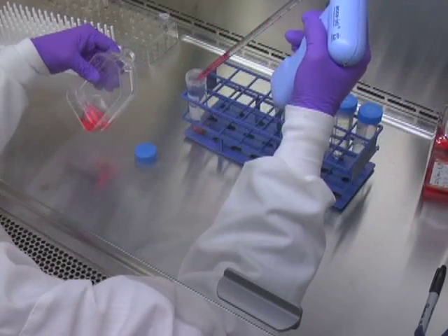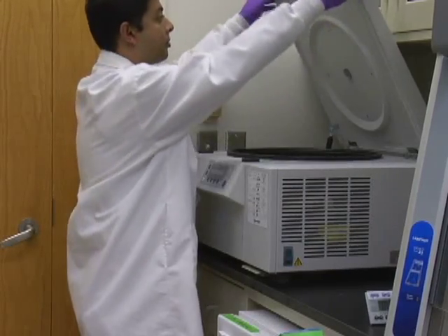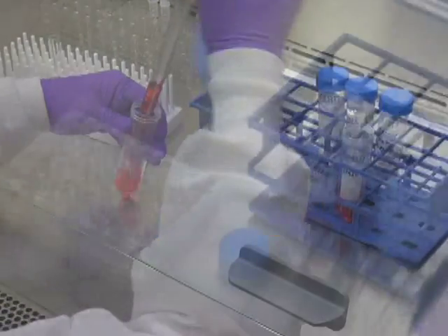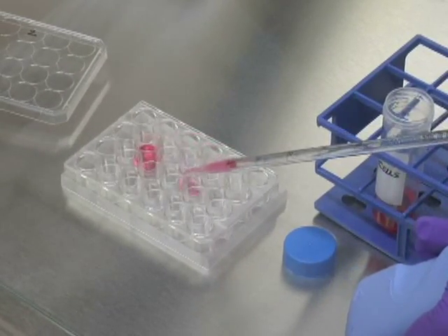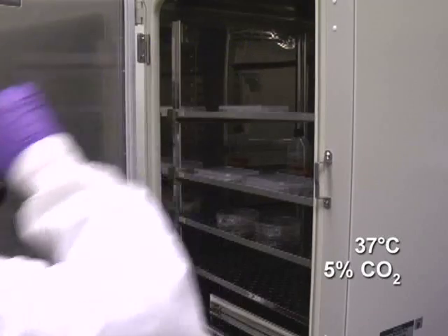Now collect the pre-activated CD34-positive cells by centrifugation and re-suspend the cells in fresh complete IMDM medium supplemented with cytokines. Aliquot 0.15 million CD34-positive cells into each of the virus-coated wells and incubate in a humidified 37 degrees Celsius incubator with 5% carbon dioxide for 2 days.